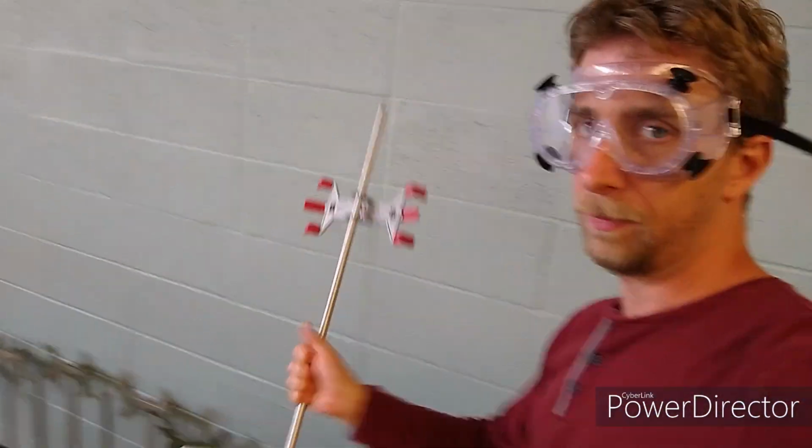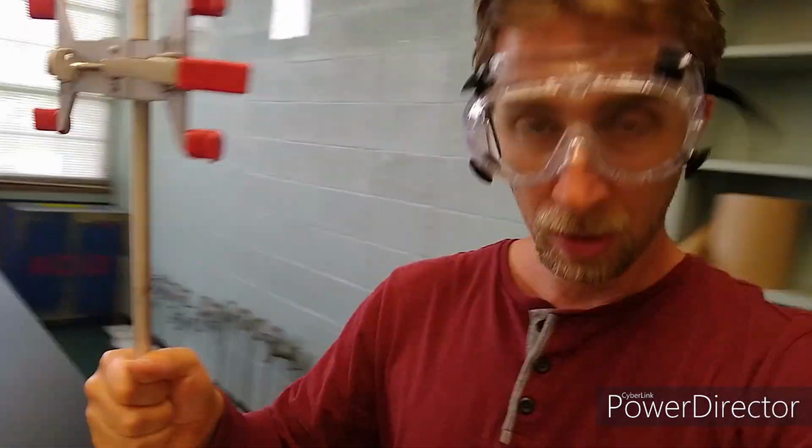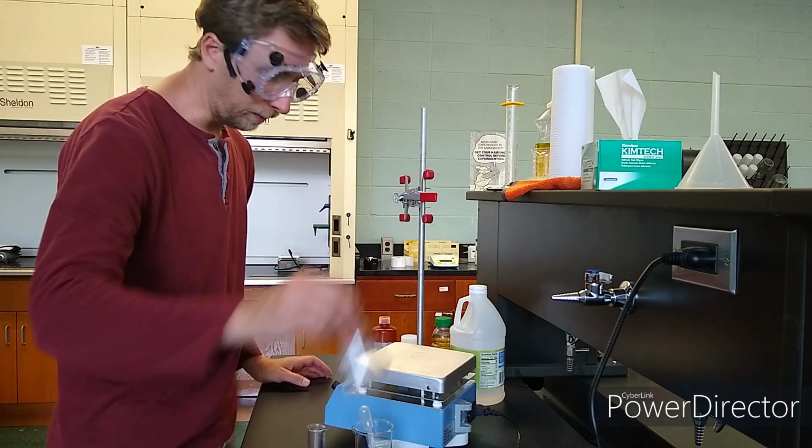And I need a burette stand. Alright. There's a nice burette stand. That looks stable enough. I need my flasks.